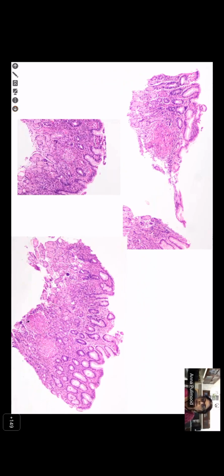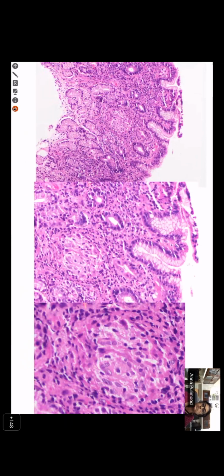What are these? Granulomas here, ma'am. How would you describe these granulomas? They are a collection of epithelioid cells and lymphocytes. On higher magnification, one can see the epithelioids, which are slipper shaped. And yes, ma'am, on the third slide I can see a typical granuloma.